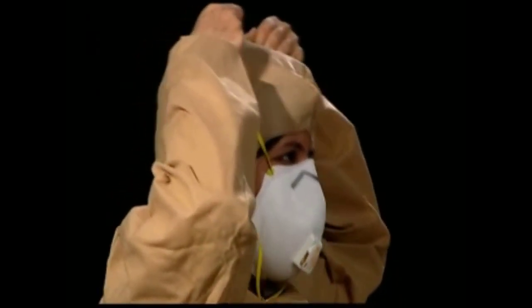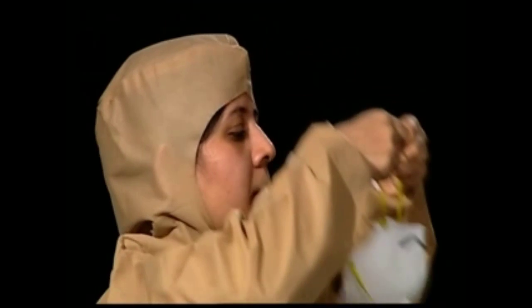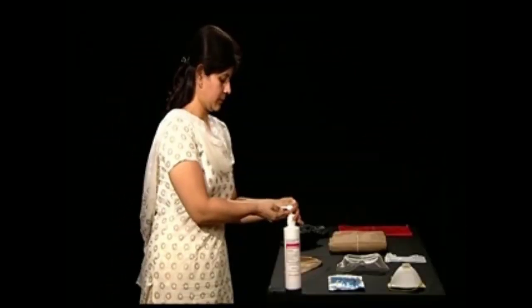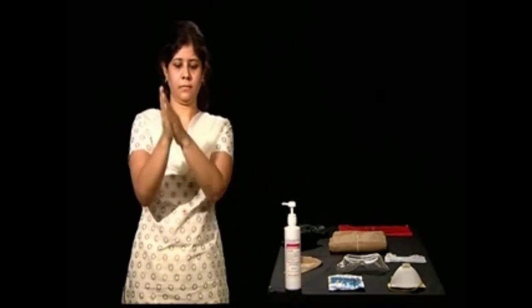No matter what the duration of interaction with any suspected patient or sample, healthcare workers must exercise hand hygiene every time they come in contact with respiratory secretions.